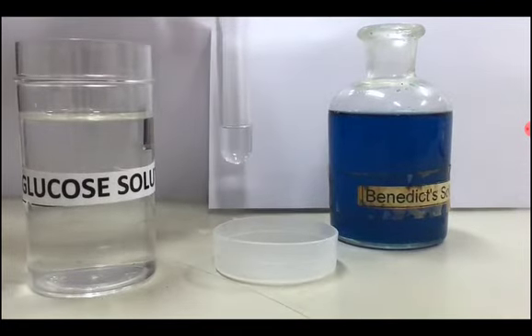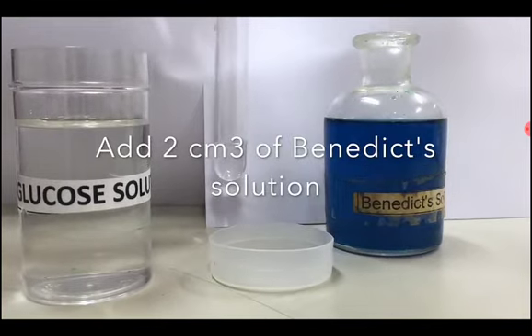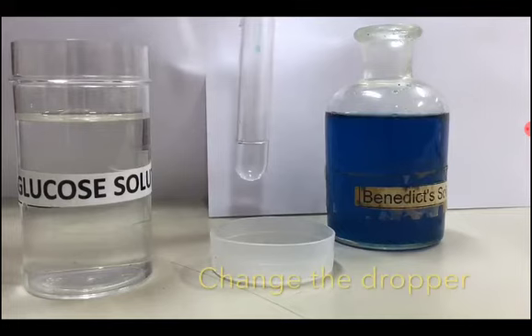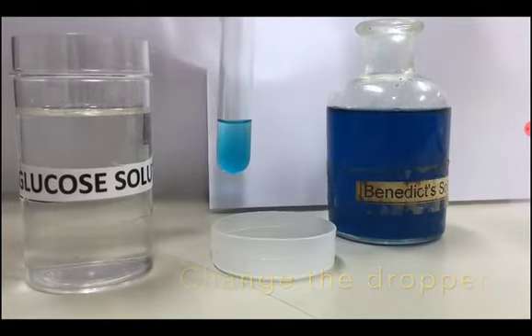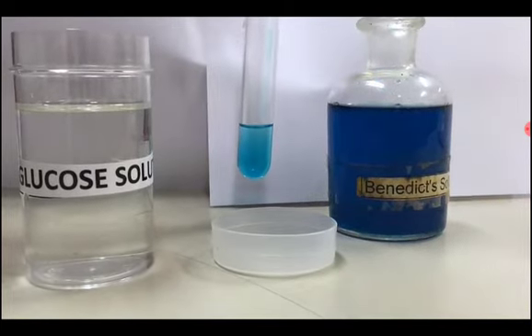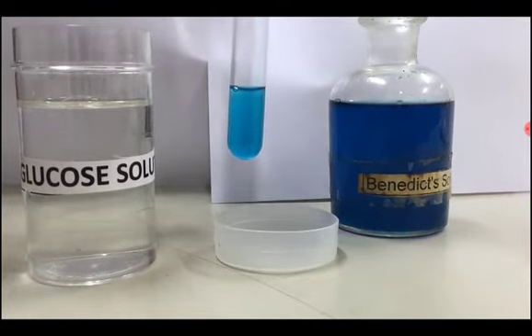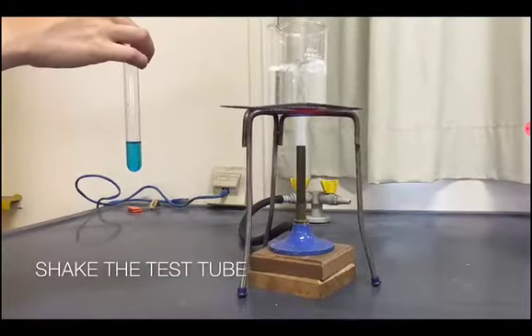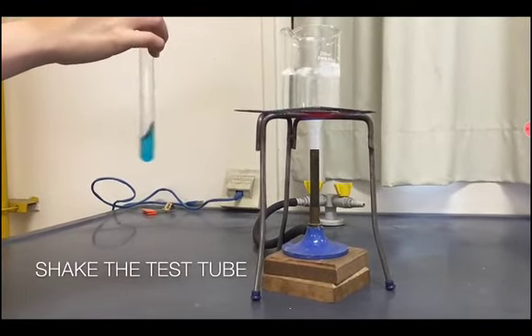This is followed by adding an equal volume of Benedict solution, and you notice that we will change another dropper so as not to contaminate the solution. Again, we use a dropper to measure exactly 2 cm³ of Benedict solution and add it to the tube. Shake the test tube to mix the contents.